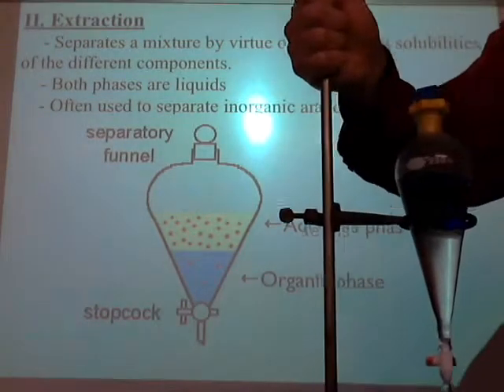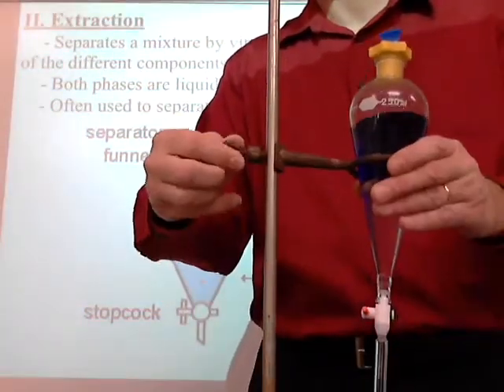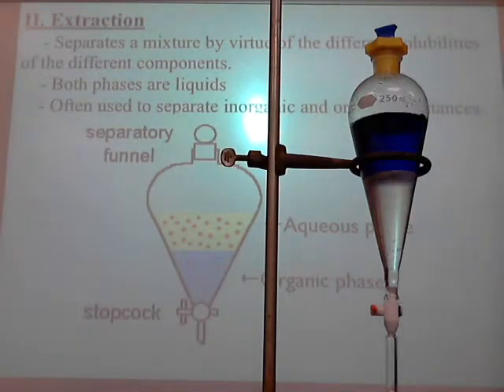Let me see if I can see this well. Here, turn that light on. Turn it a little bit. All right, and if you look at this, you can see the two layers are obvious because of the color.